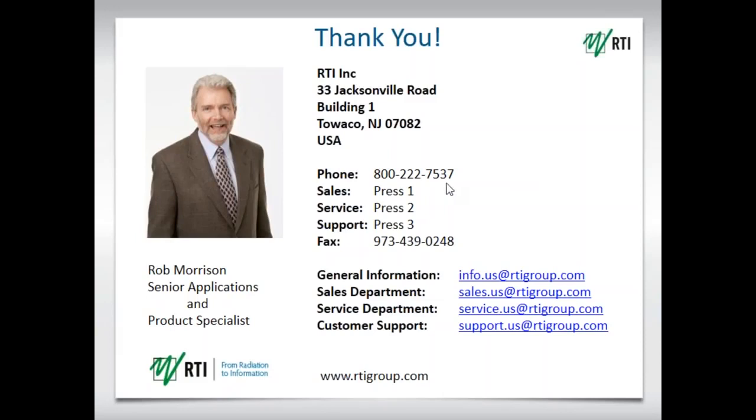Perfect. I think we have time for one additional question, and I love this one as our office all uses one system. So will the Ocean Professional work on my Mac computer? That's a very good question. Ocean Professional is meant to work on Windows operating system.